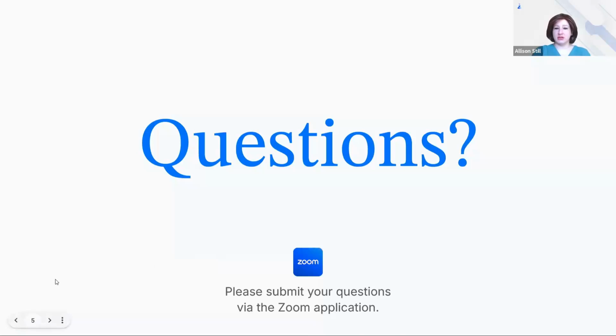And you wouldn't have to use all three of those features. If you don't want them entering orders, you can hide that part and just have them viewing reports, or maybe vice versa. And you would have full control. There's no limit on the number of users that you can have on there. And you would set those up and control what all clients and providers each user has access to.